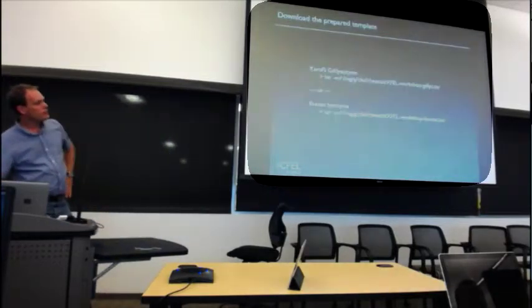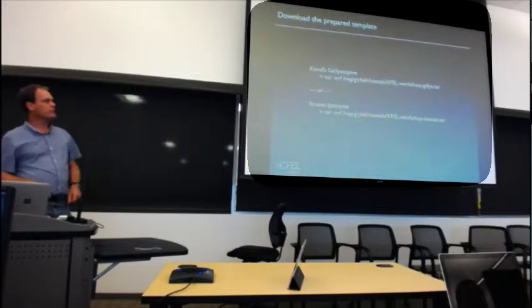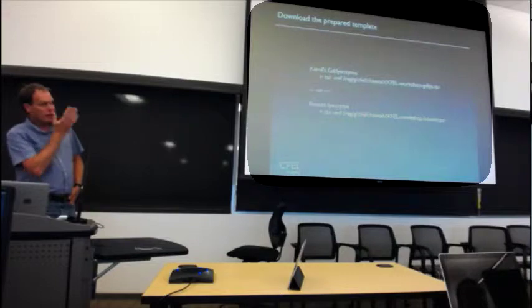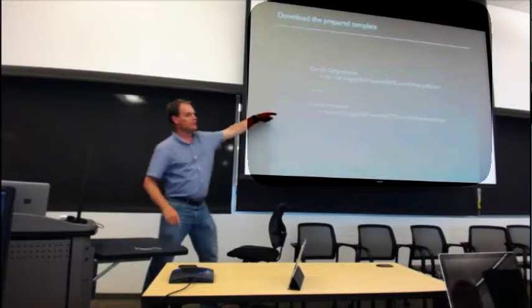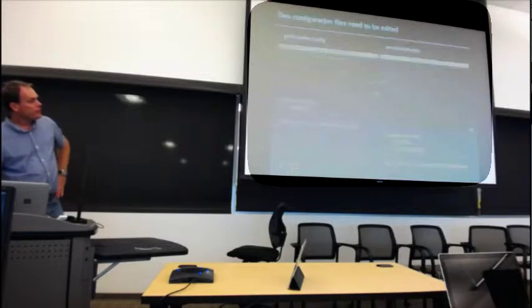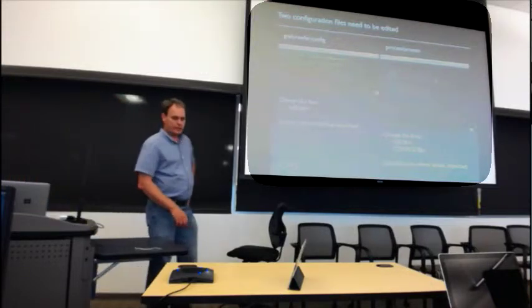Then I created a couple of template things. There's a series of files, a series of structures that you need. We'll get into this later. Unpack those things. Pick your data set, probably Carol's last time. That's the one I tested. I actually didn't test this one. I grabbed something that I used ages ago. Then you need to change 2 files to tell you where the data is.